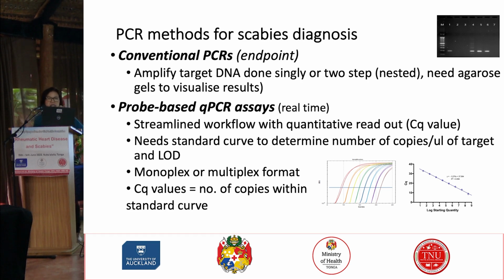What it does is, from the DNA of the mite, it makes several copies so that you don't see the mite, but you can have mite material in the sample that you collect, either by skin scraping or swabs. Then from the genetic makeup of the mite, you amplify a portion of that, and to amplify that you need an instrument like a PCR machine, and you design primers to start the amplification, or making several copies of it, and then you need a probe too so that you increase your sensitivity.